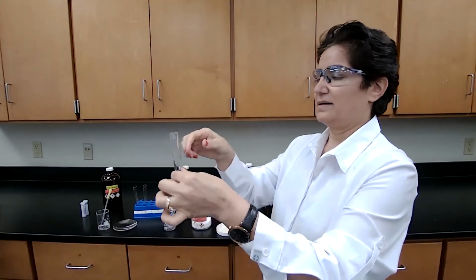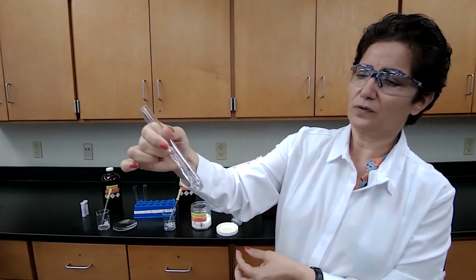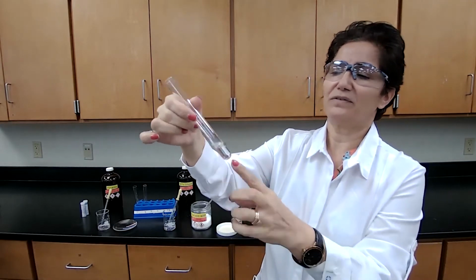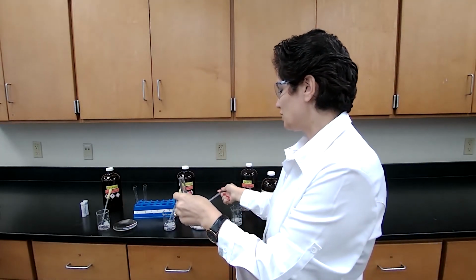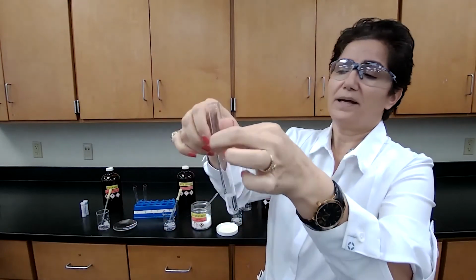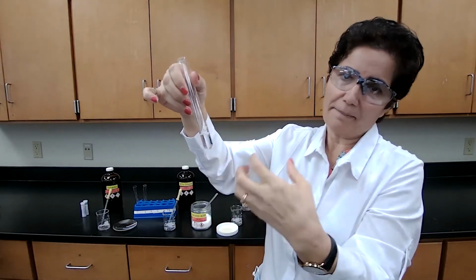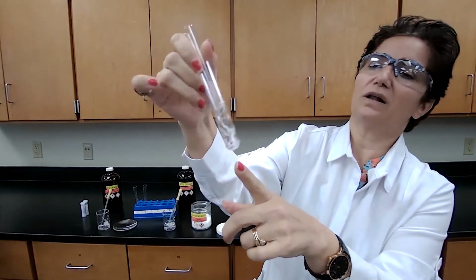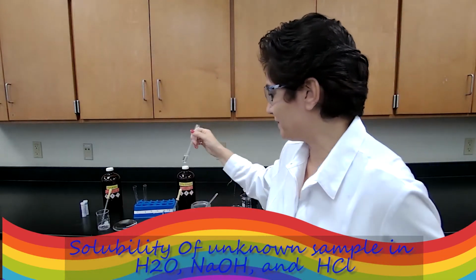Now, you just have to shake it just like before and give the same time that we gave to the other solution with the sodium hydroxide. But this one is not floating. The behavior is kind of different. It settles all of a sudden, as soon as I add, it settles down, which shows more of the behavior of insoluble compound. It settles or it floats on top. Either condition means that it is not soluble. If it's floating inside the liquid, that means something is happening. So in this case, it just settles right away and is not expected to dissolve. So keep that in mind when you are working with the unknown sample. So this was the solubility for the known samples.